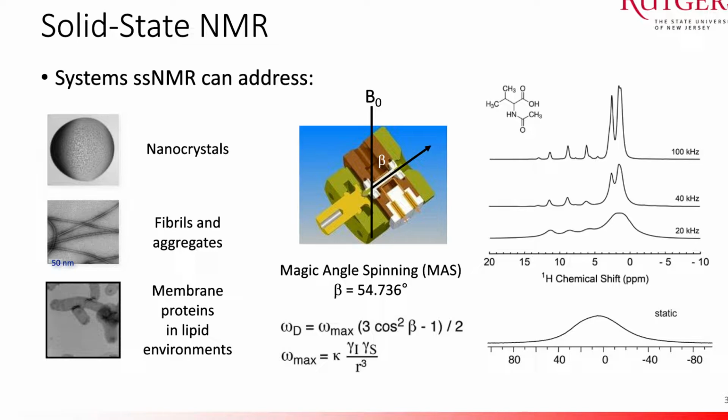And there was this last part that I found really exciting, mostly because I feel like it's the place where standard structural biology falls down the most. It's the hardest to study membrane proteins in their native lipid environments, and a lot of the more static techniques, so an X-ray crystal or a cryo-EM structure, might have a harder time understanding exactly what happens on a lipid membrane. So this is where I decided to focus my efforts.